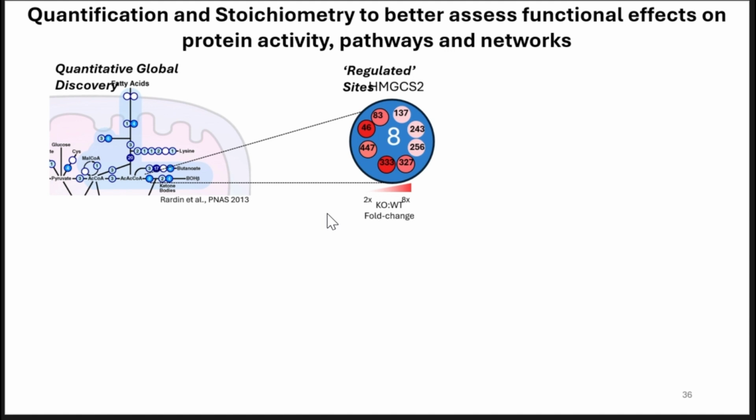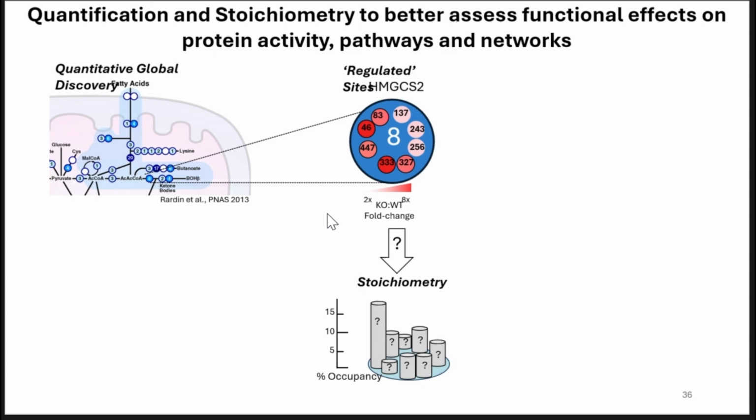So this first little sketch here is supposed to show you the fold regulation that you can determine in PTM peptides. But actually, for some biologists, more importantly than that, is what we call stoichiometry.